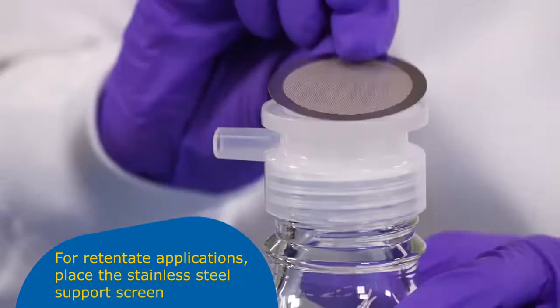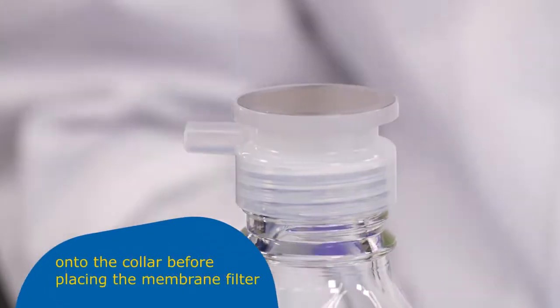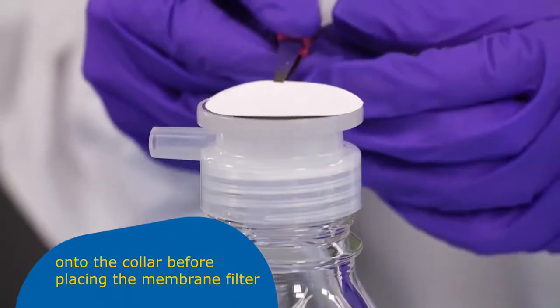For retentate applications, place the stainless steel support screen onto the collar before placing the membrane filter.